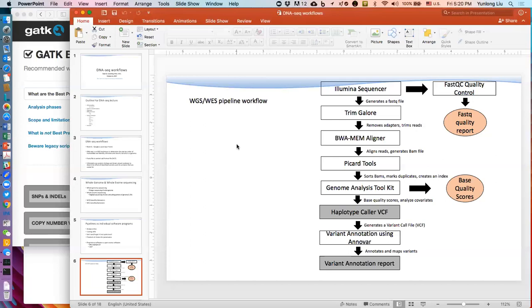The key to that is using the smaller BAM file will improve the quality of all the rest of the steps through Picard, okay? Picard tools is wonderful because it takes your BAM file and then it marks, indexes, and sorts your BAM. So what that means is when you were making your libraries, when you were doing your amplification steps, when you were doing your sequencing, any artifact that is left, any reads that aren't an appropriate size, are removed. It leaves you with a file where there are no more marked duplicates from PCR or other methods or from the sequencer itself. So the quality of your data, the integrity of your data, and hopefully the annotation at the end will be much more reliable and much more clear.